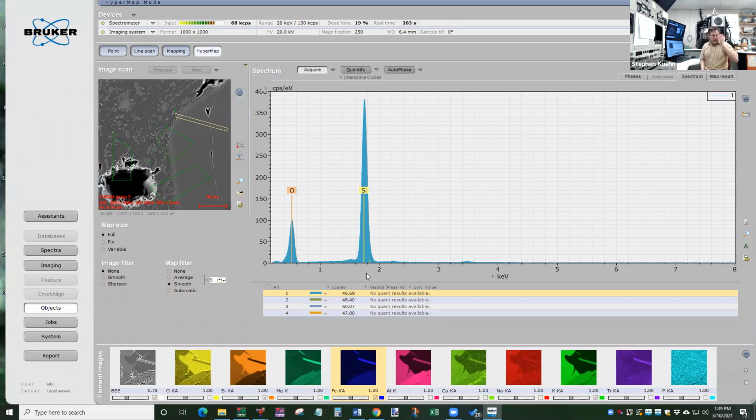So this is one of the most common minerals of all. Everybody knows it. Some people have a little crystal of it they might carry around. If you're on a beach, oftentimes it's the number one ingredient in the sand. So this is the mineral quartz.